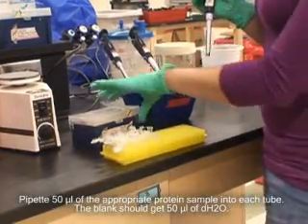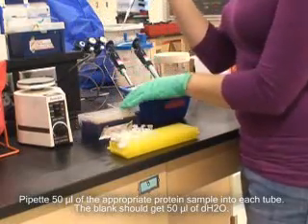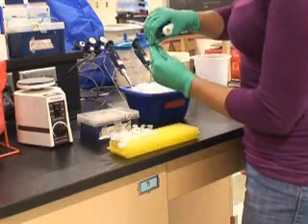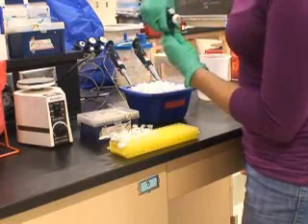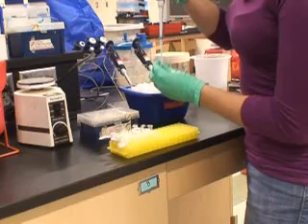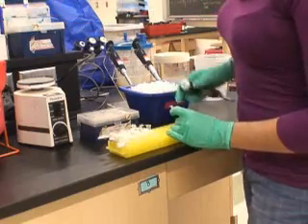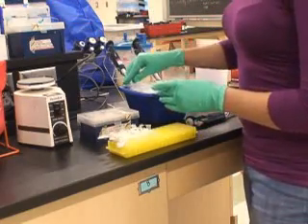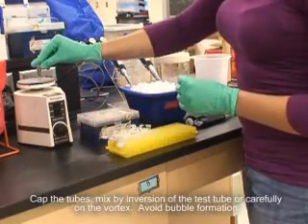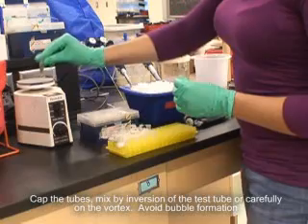Pipette 50 microliters of the appropriate protein sample into each tube. The blank should get 50 microliters of distilled water. Cap the tubes and mix by inversion of the test tube or carefully on the vortex. Avoid bubble formation.